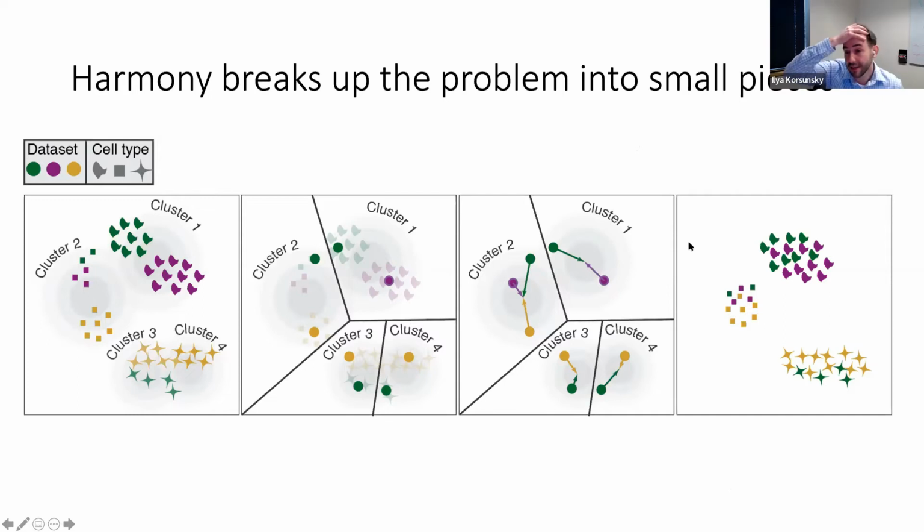So for spike-ins, you can definitely imagine a case where you can do it, and Harmony is just regression, so we can figure out how to include that information in the regression model, right? What I would be careful about is assuming that if I have a spike-in of one cell type in my batch effect, let's say over time, and my actual cells of interest are not that cell type, not 293, right? Batch effect is going to affect your positive controls differently from your actual cells of interest. So it's not that batch is going to affect your spike-in the same exact way that it's going to affect your other cells. So I don't think it entirely solves the problem.